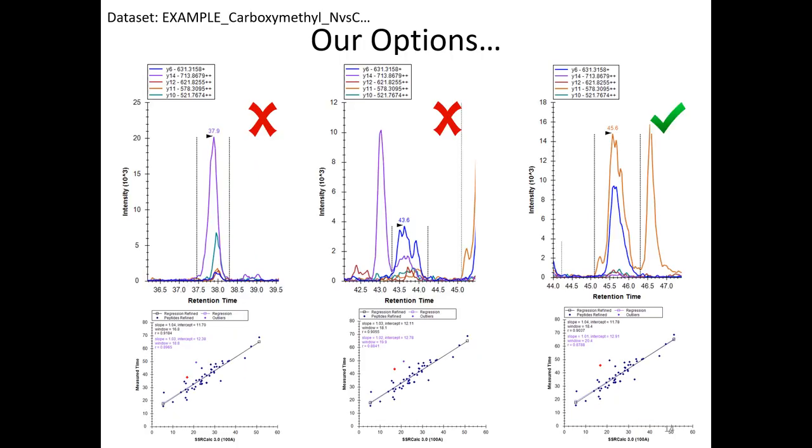If I look at these and compare where their retention time is, what's interesting is this big purple one looks more like an interference. You see how its apex doesn't line up and everything underneath it is a little off to the right? This is one that's tricky and you have to be careful of. This is not how normal peptides should look. This one has a lot of signal in it, but really none of the transitions have the same apex. Maybe the blue and the purple do, but nothing else really does. And this last one, even though it's not ideal, if you look at the very center, it's got probably the most overlap out of all the choices.